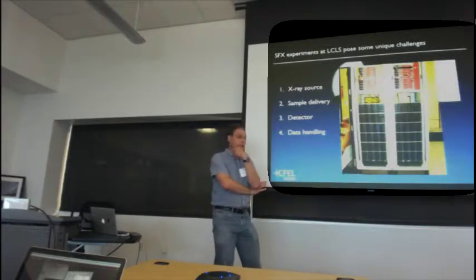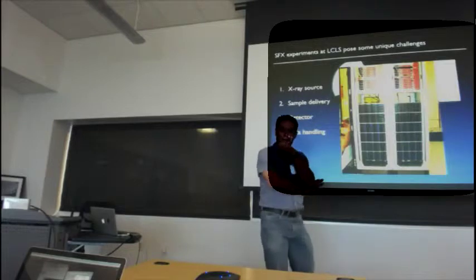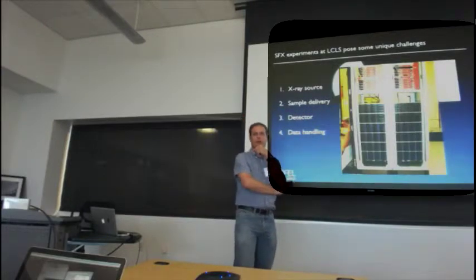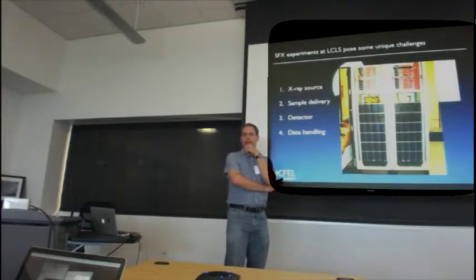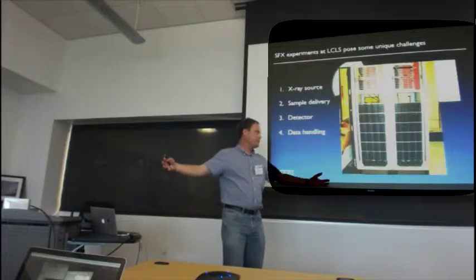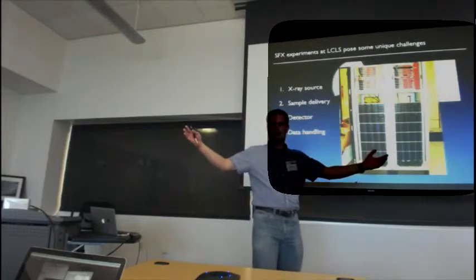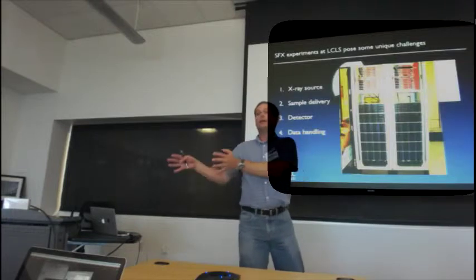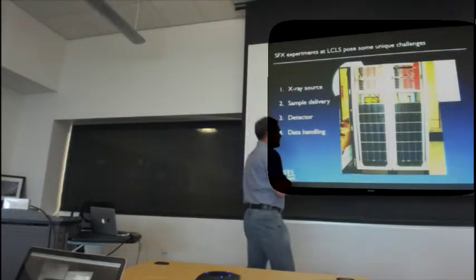So we pretty rapidly realized that if we want to make this technique accessible to the widest range of research groups and the widest range of researchers, then we needed to do something pretty quickly to mean that people didn't have to deal with these huge volumes of data, but could instead shrink it down into something that was manageable pretty quickly, and then take that reduced data home as well.